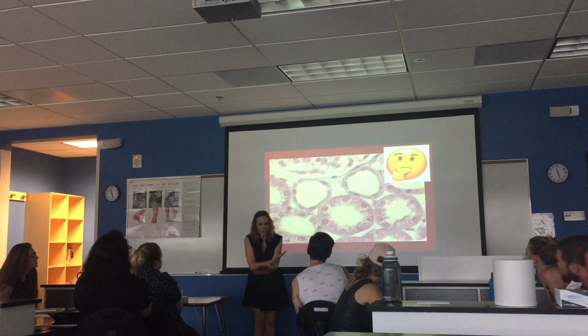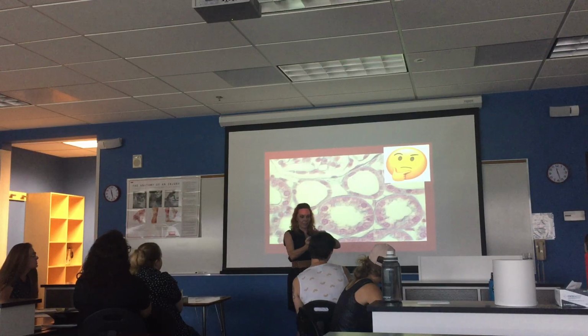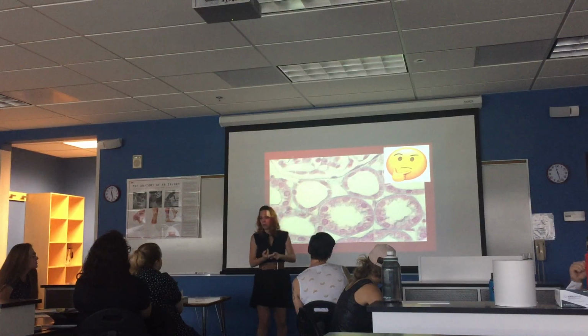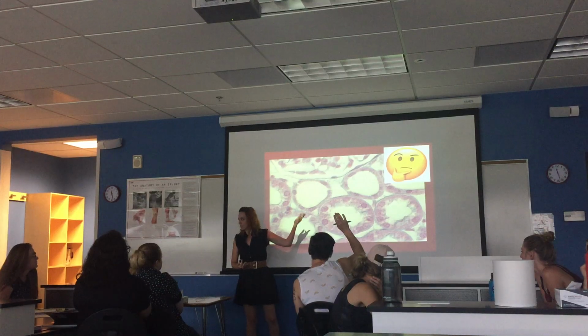Right? It's going to be a section through the intestine, and therefore you're going to have smooth muscle, connective tissue, and a simple columnar that's lining, and so forth, right? This is a slice through the kidney, so we're going to see all kinds of things on there.